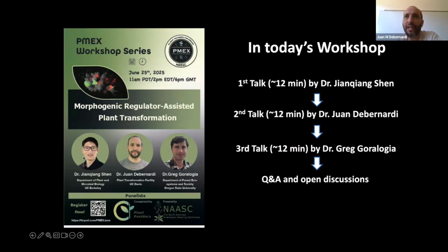But I studied GRF-GIF during my PhD, and those plants are bigger, they have phenotypes. If you are studying a molecular pathway that controls development, you don't want to have GRF-GIF active there. In those situations, having an inducible version can be useful.